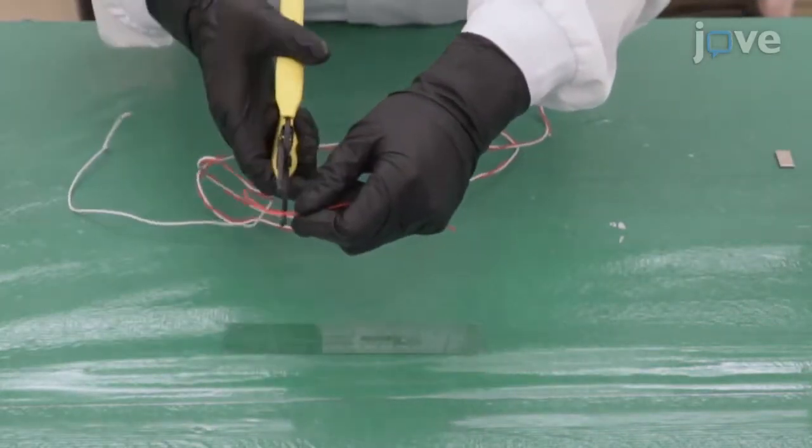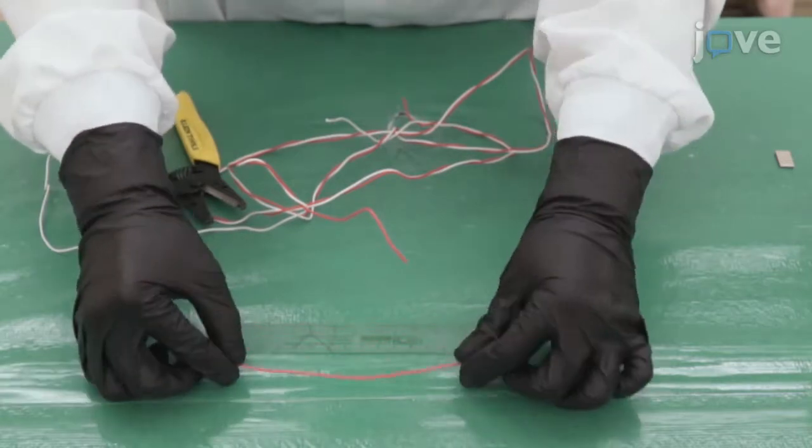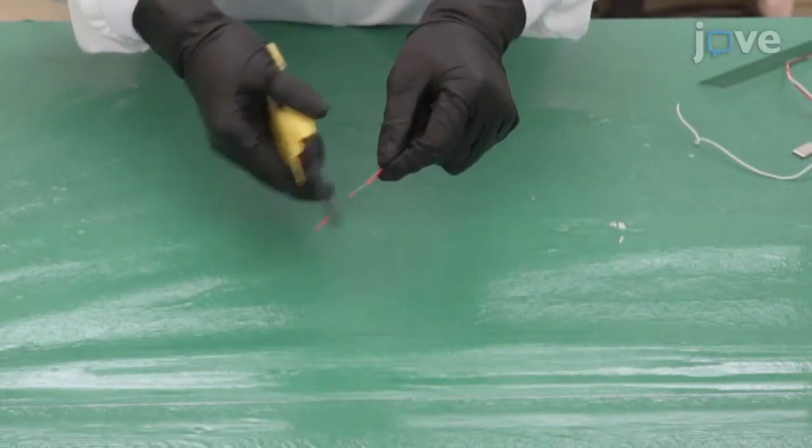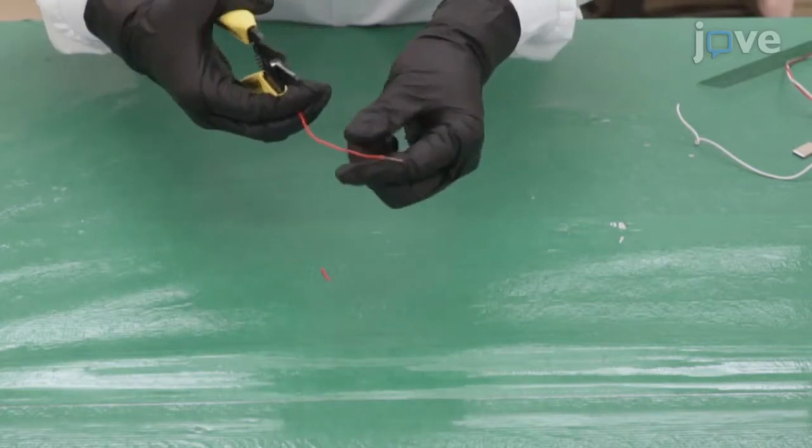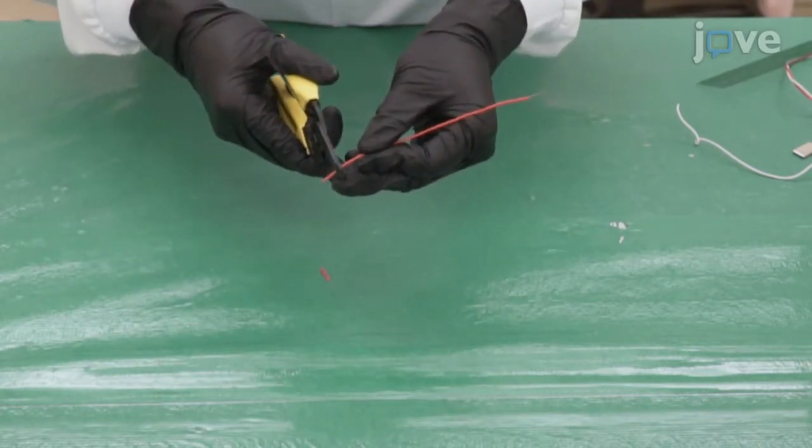To prepare the working electrode, cut a five centimeter long piece from a one to two millimeter diameter electrical wire and strip away about one centimeter of the protective plastic cover on both ends to expose the interior copper wire to air.